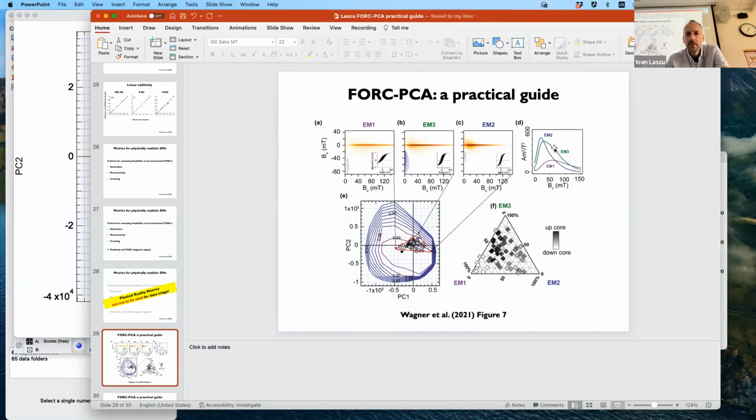So this bump in this curve will become more prominent or not. So the second PC actually explains the variability in the data set, as you move along it, due to this biogenic hard component, which is magnetofossils that are more elongated. Conventional magnetofossils, not giant.